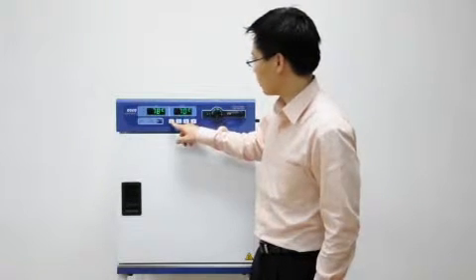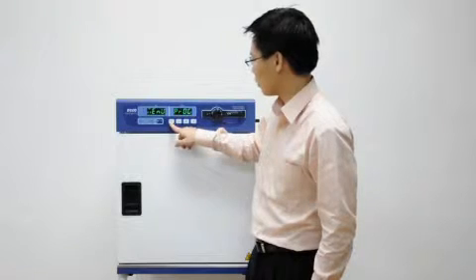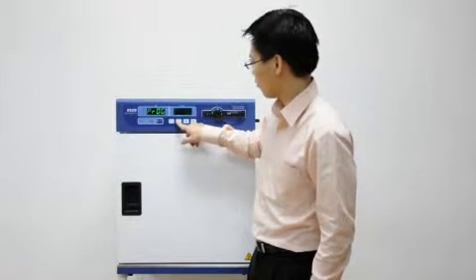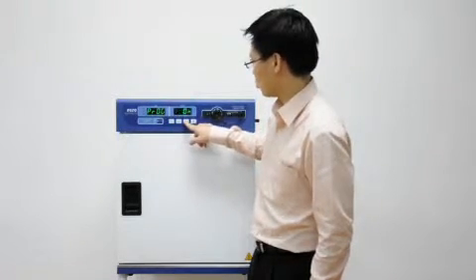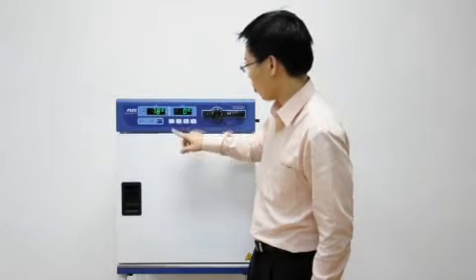Now I would like to demonstrate the program functions of Esco laboratory ovens. First you have to enter the program function by hitting the menu key twice. Enter the program function. You have to turn program mode on. So now program mode is on.